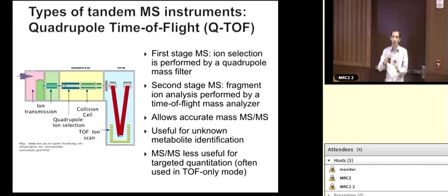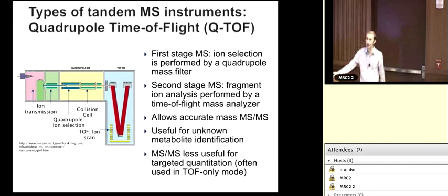Why don't we set up to make sure that we can do the quantitation that you need, but let's also get all this other great data that you can go back to and mine in an untargeted way if you see fit, or run the untargeted assay, and then we'll just be sure that we provide the quantitative, targeted data that you need out of there. Rather than jumping to a highly targeted triple quad assay right from the beginning, especially if you're starting out an experiment, look at picking a method that can answer more questions, even ones you weren't thinking necessarily about asking, because you might discover that you want to follow up on something that you hadn't predicted. But it's all a case-by-case basis, and it depends on what you want to do.